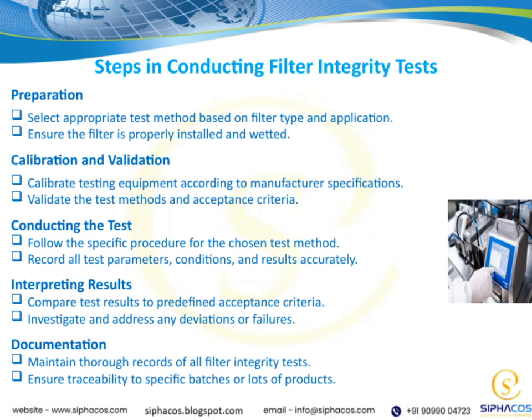Next, let's talk about interpreting results. Once you have your data, compare the results against your predefined acceptance criteria. If there are any deviations or failures, investigate thoroughly to understand the root cause and address any issues promptly. This step is vital for maintaining filter integrity and ensuring ongoing quality.